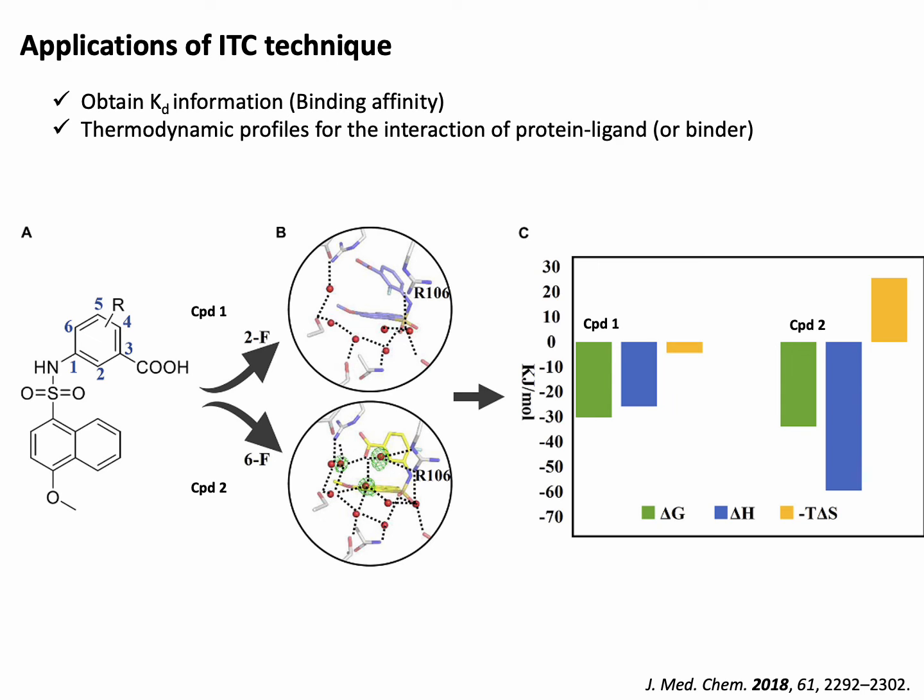In contrast, the binding of compound 1 harvests the more advantageous entropic term, ascribed to the distortion of the water molecule network compared to compound 2. Accordingly, the complex structure associated with the thermodynamic data demonstrates that the water molecule network in the binding pocket of the protein should be taken into consideration in the process of lead discovery.